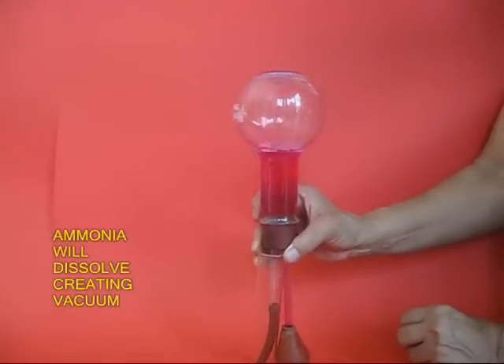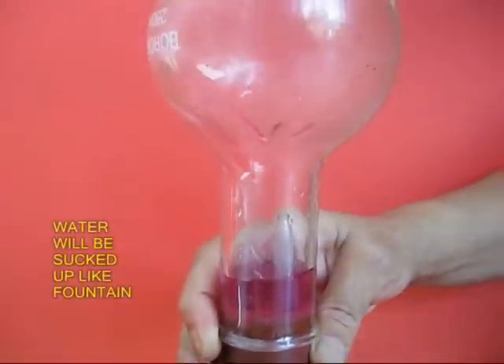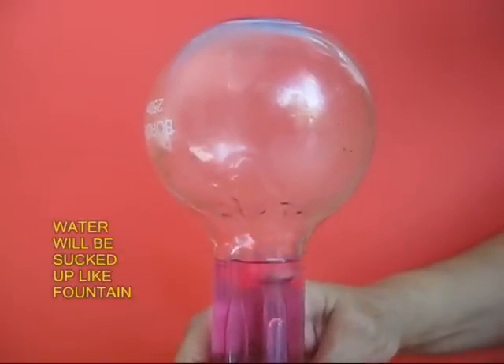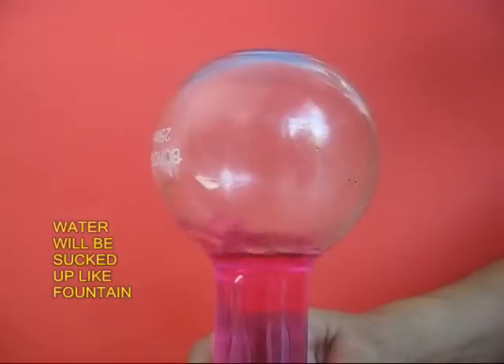The phenolphthalein solution meets with ammonia and becomes alkaline, and so the color turns pinkish. See this phenomenon once again. So this is how you make the ammonia fountain.